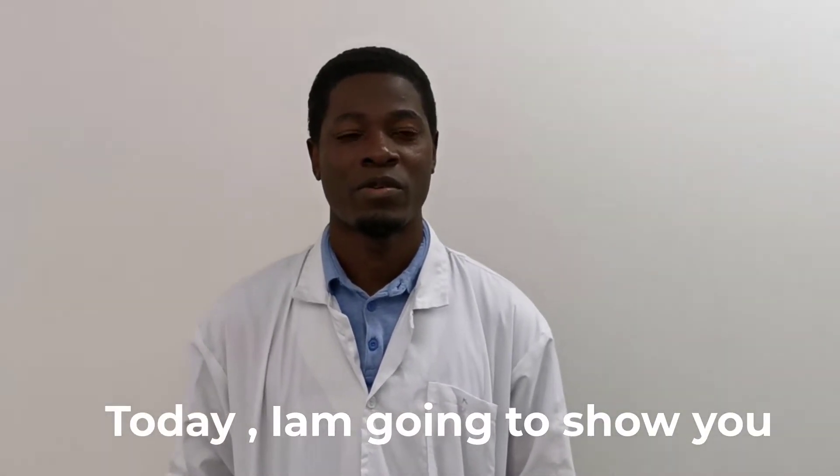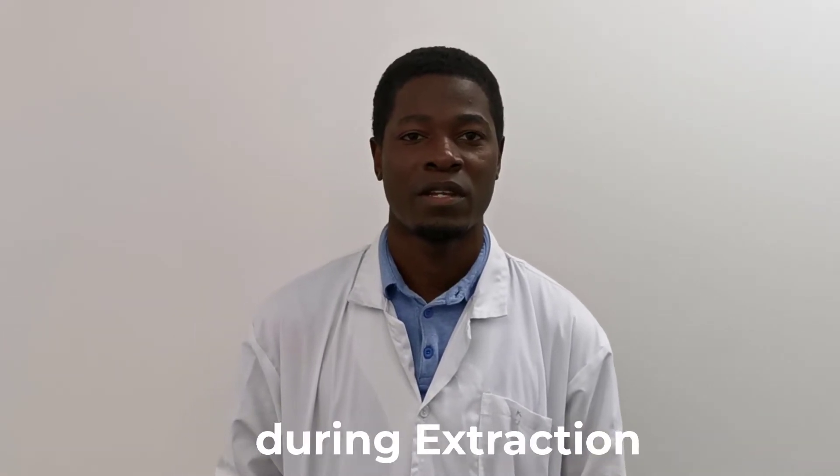Hello, I'm Francis Kawadia from Ghent University. Today I'm going to show you how to make a sieve for collecting nematodes during extraction.